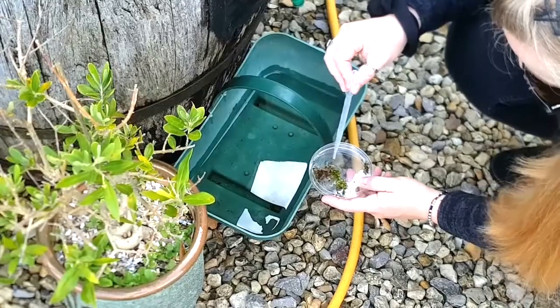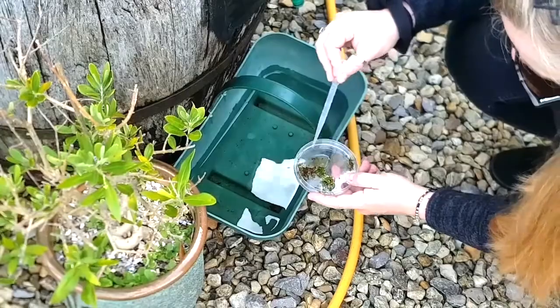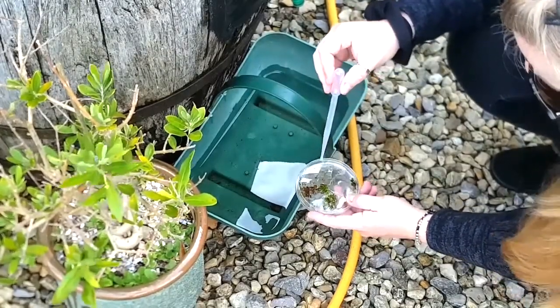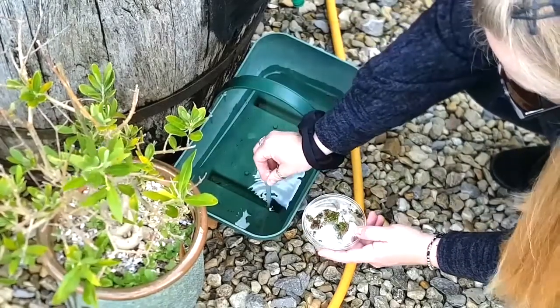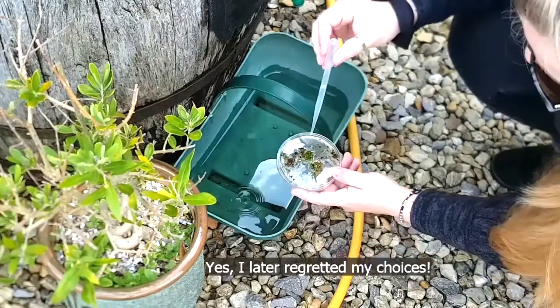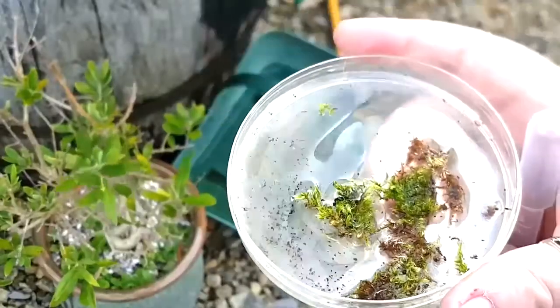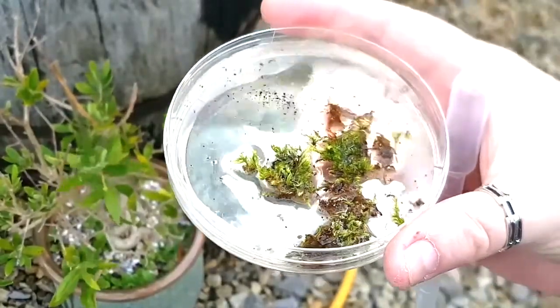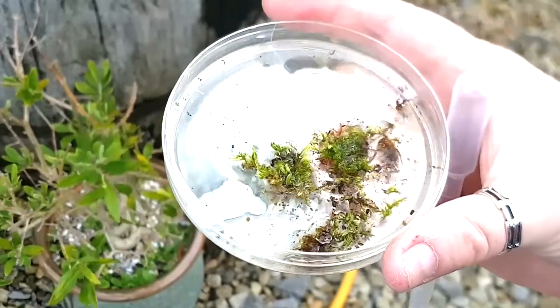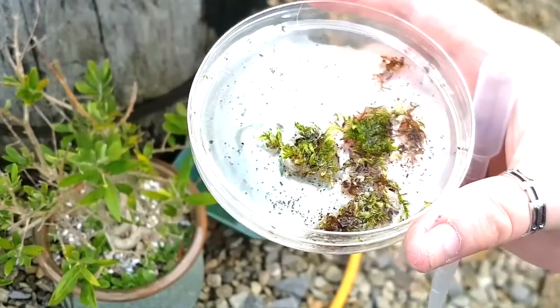The more water you put in here, the longer it's going to take you to go through the whole sample. I always make the mistake of putting too much in, but I want to just make sure that moss is really nice and wet, and I've got quite a lot, so I will regret my decision here. I've got about 5 pipettes worth more than I'll probably have time to go through. So now that's got lots of rainwater in it, I'll just need to leave that for about 24 hours and just leave everything to rehydrate. So I will see you back here when the sample's ready to analyse.